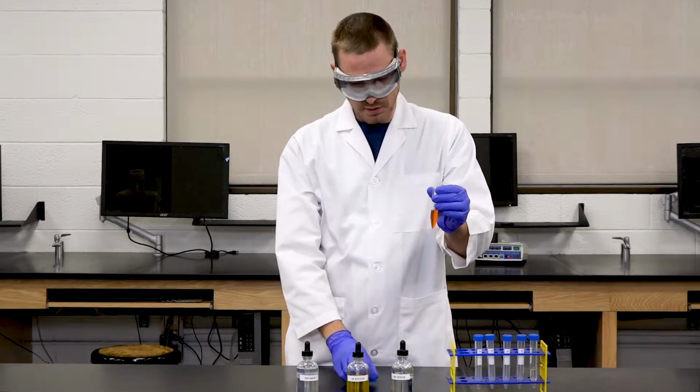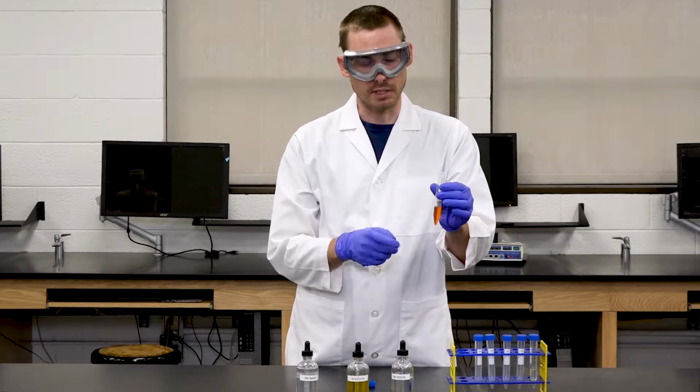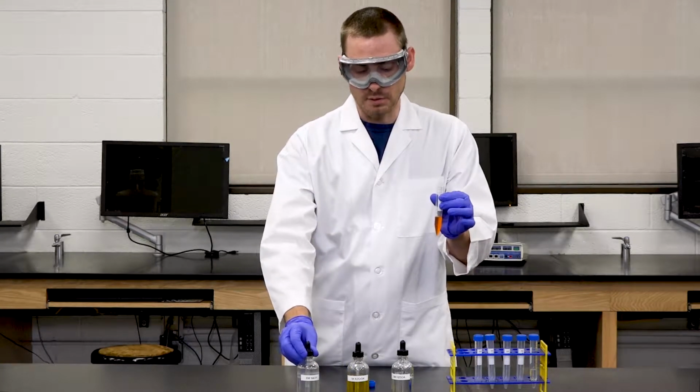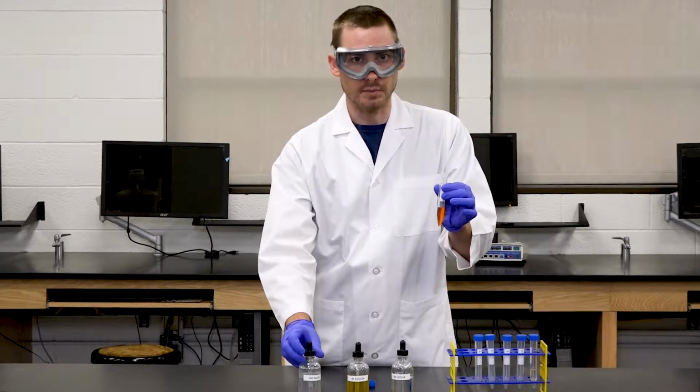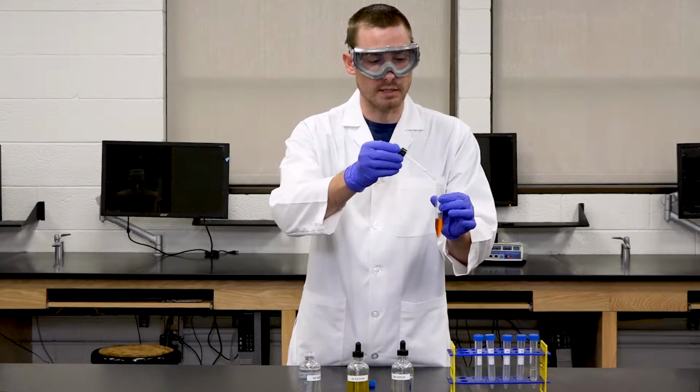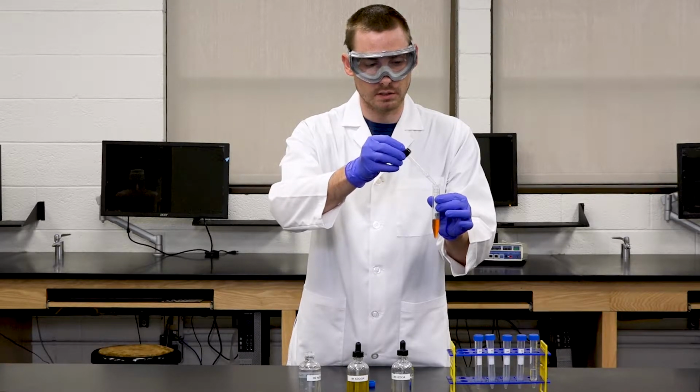So now that the solution has become fully the dichromate ions, it is now orange in color. To reverse the reaction, we can add sodium hydroxide, which will return the solution to the chromate ion and will be yellow in color, like so.